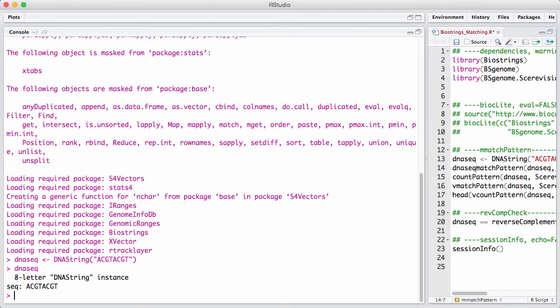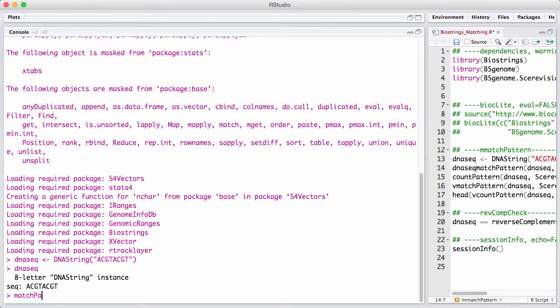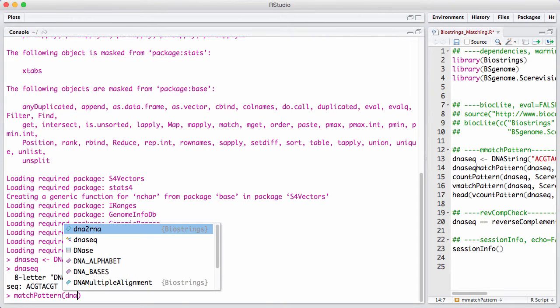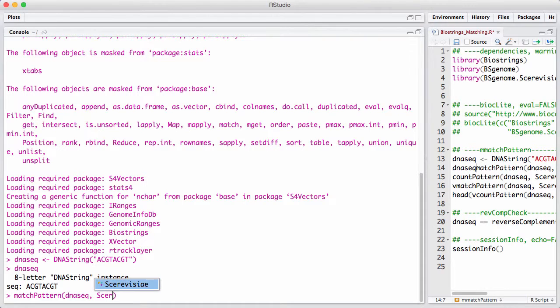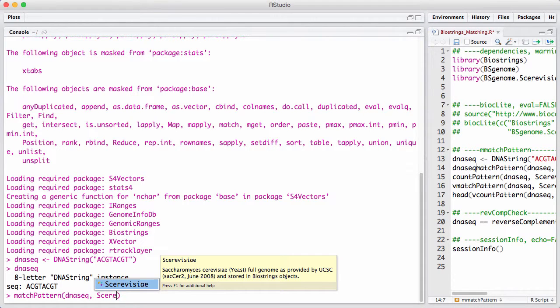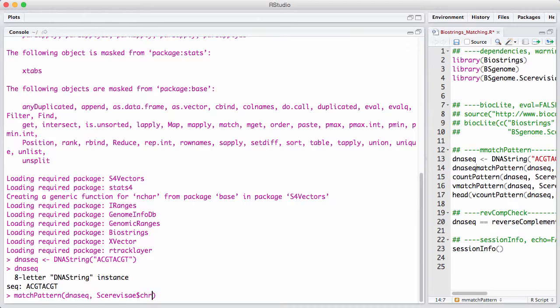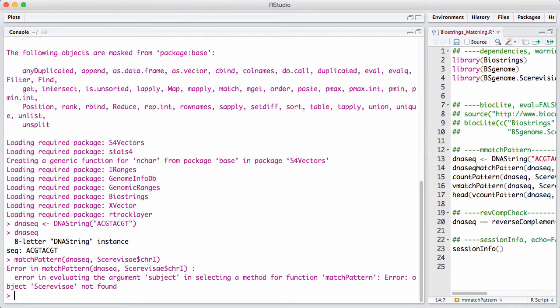Matching a single string to a single string is something we do with matchPattern. We take our sequence, and then we now have to take a specific yeast genome because we are mapping a single string against a single string.